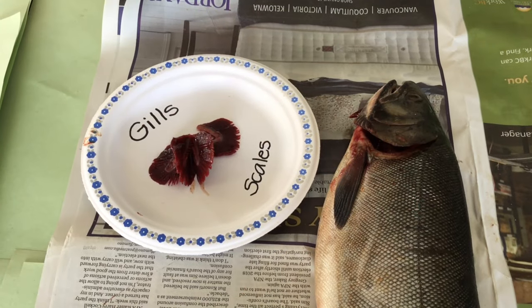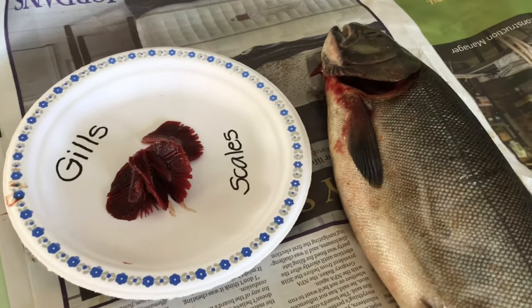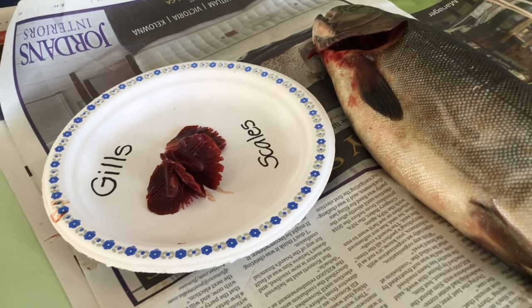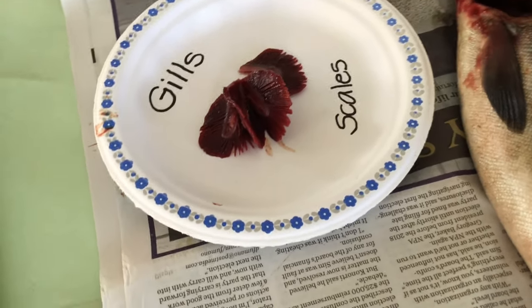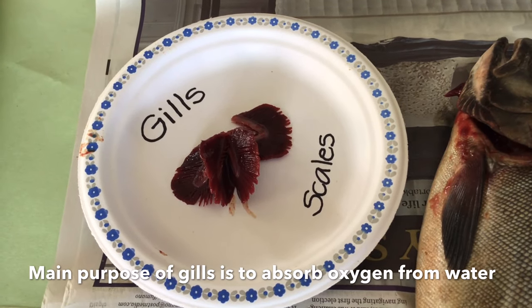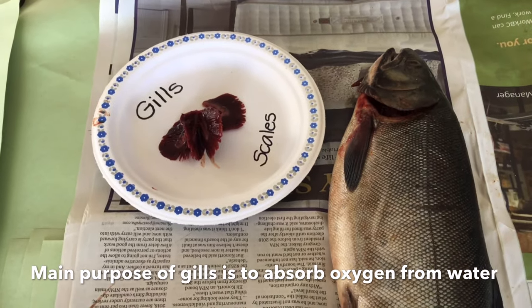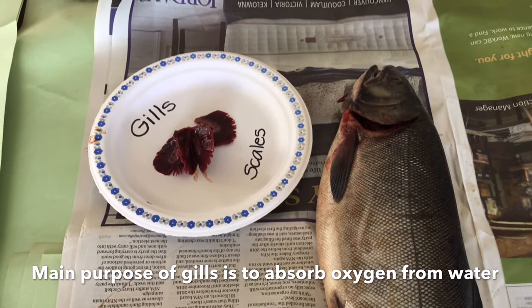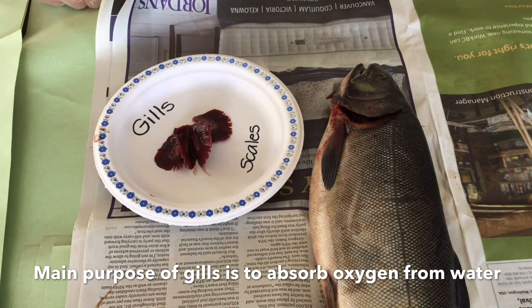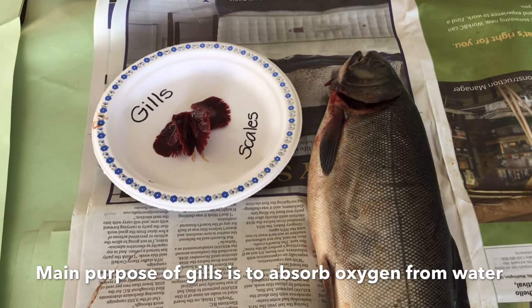Now, the gills. What exactly is the purpose of the gills? Now that you've drawn them, and you've drawn the four layers and the gill rakers, the main purpose of the gills is to absorb oxygen from the water. The way we use our lungs, we breathe in. From air, we get oxygen, and our lungs are the organ that are managing that. For the salmon, it is the gills that are doing that job, and the oxygen is coming from the water. So the main purpose is to absorb oxygen.